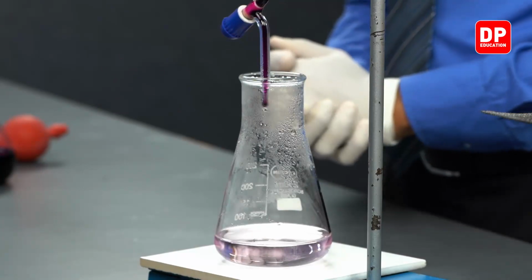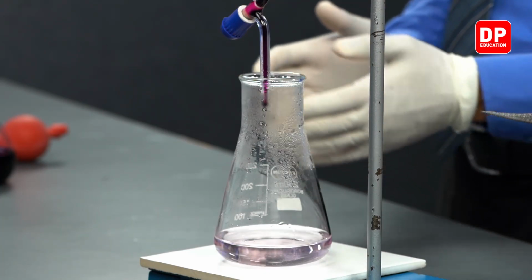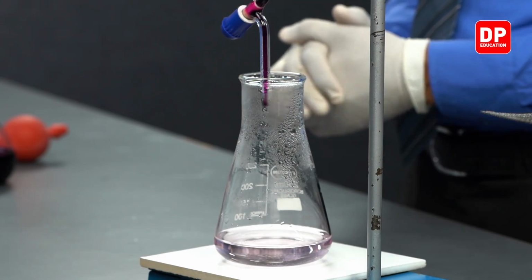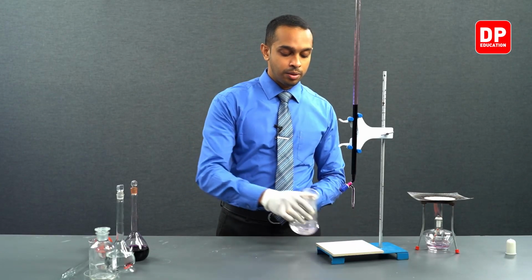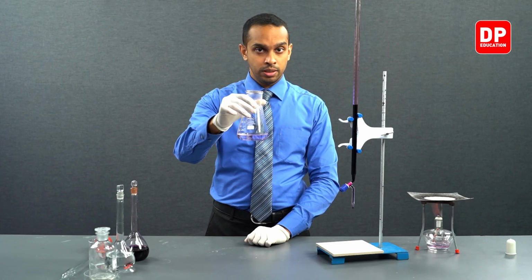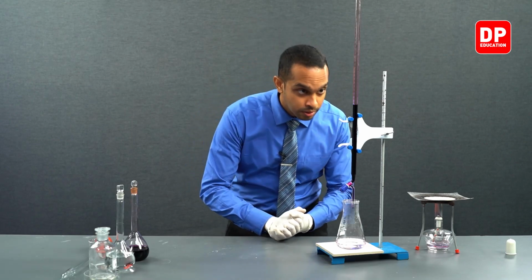Now we have obtained our endpoint over here. The endpoint over here is signified by a permanent pink color or a permanent slight purple hue that you observe over here in the titration flask, just like in the previous two titrations. So this is an indication that we have obtained our endpoint. All that is left for us to do is taking a look at the burette reading at this point.